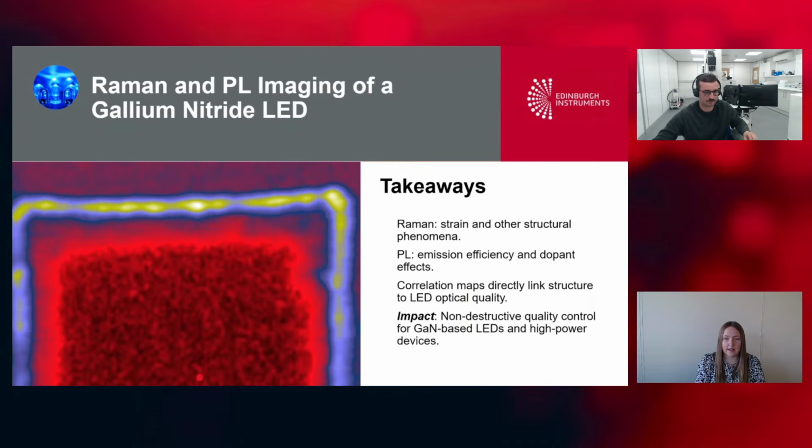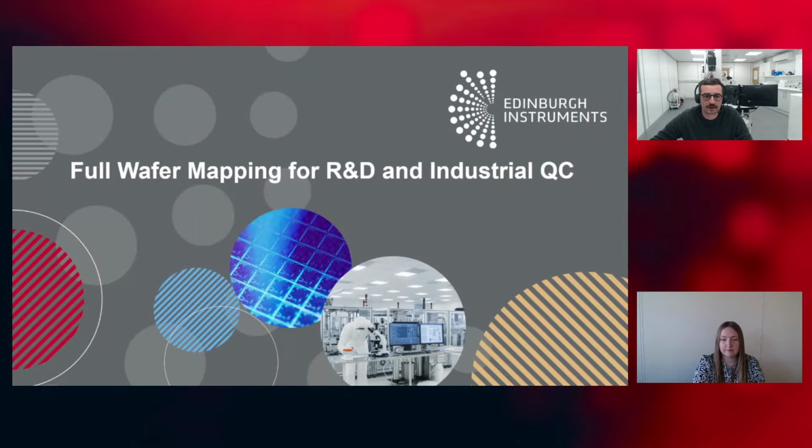Perfect, thanks. The examples we've gone through so far have been geared more towards the academic, research-stage level, looking at your samples. But we're now going to introduce how we can take this a step further as we move into industry, and how we can integrate wafer mapping of an entire wafer into our software. Yep. So as Angela said, we're now going to scale up from single devices to entire wafers.